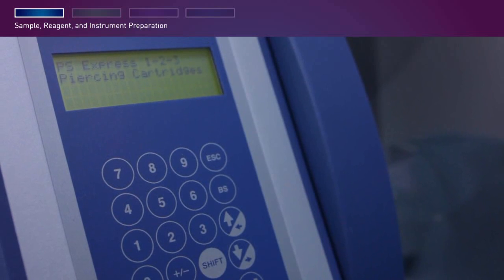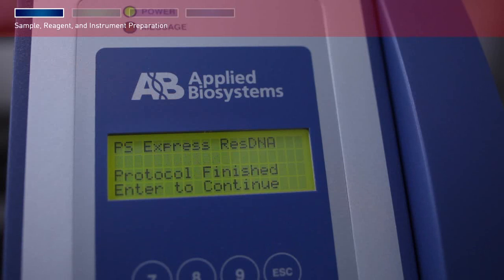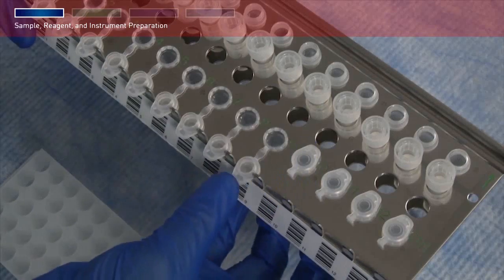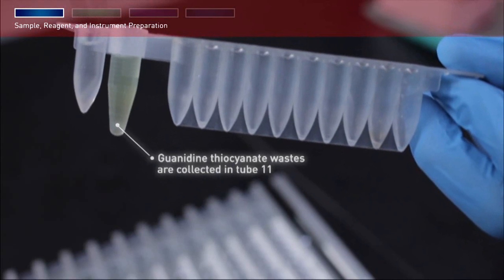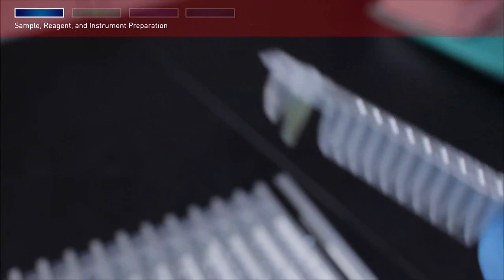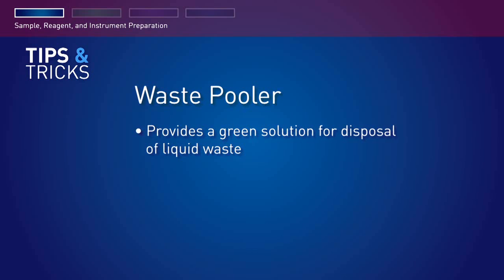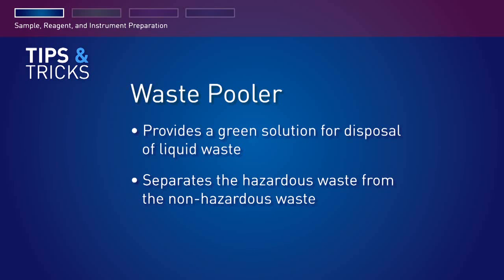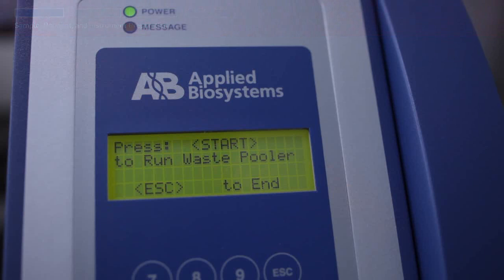At the end of the run, the instrument beeps briefly and the digital display shows additional options. Select an option, then open the instrument door, remove and cap the elution tubes containing the purified nucleic acid. If you ran the waste pooler protocol, the guanidine thiocyanate wastes are collected in tube 11 and the alcohol-based wastes are collected in tube 12, leaving the rest of the cartridge empty and easy to dispose. The waste pooler separates hazardous waste from non-hazardous waste and consolidates it, enabling a safer and easier way to dispose of spent reagents. To run the waste pooler, close the instrument door and press Start, or press Escape to skip and return to the main menu.